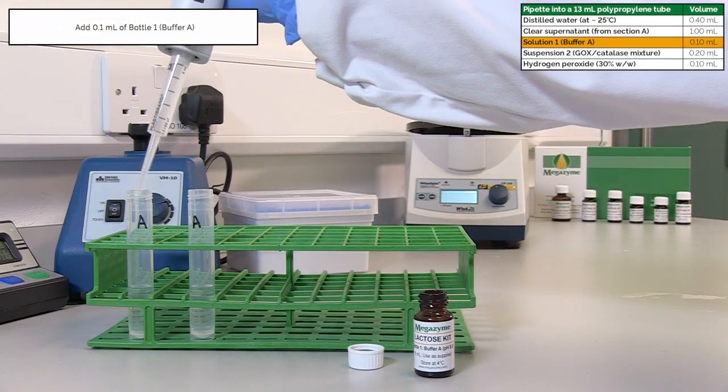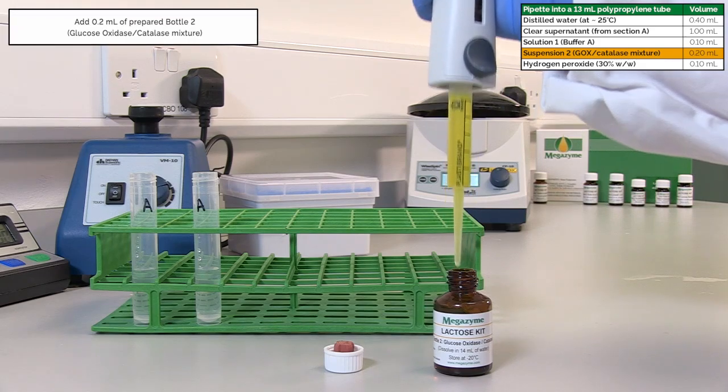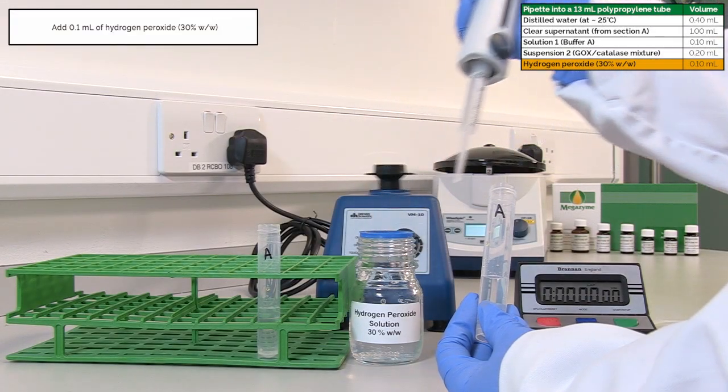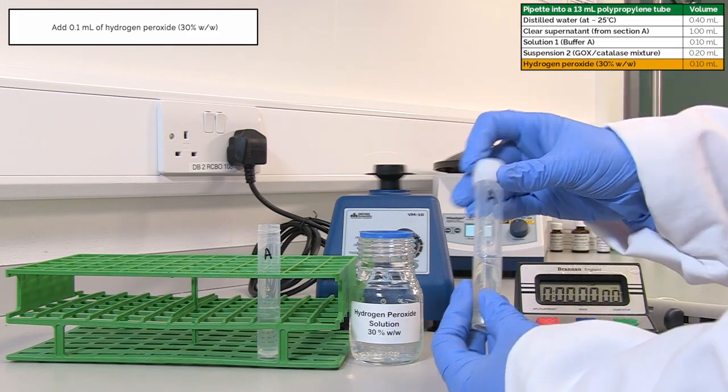Add 0.1 ml of bottle 1, buffer A. Add 0.2 ml of prepared bottle 2, glucose oxidase catalase mixture. Add 0.1 ml of hydrogen peroxide, 30% weight per weight.